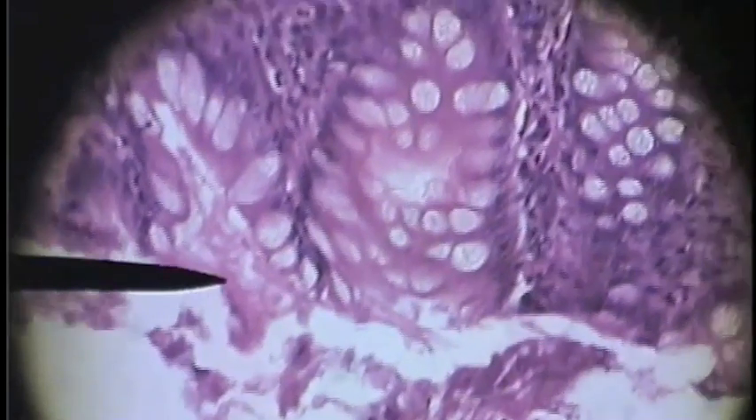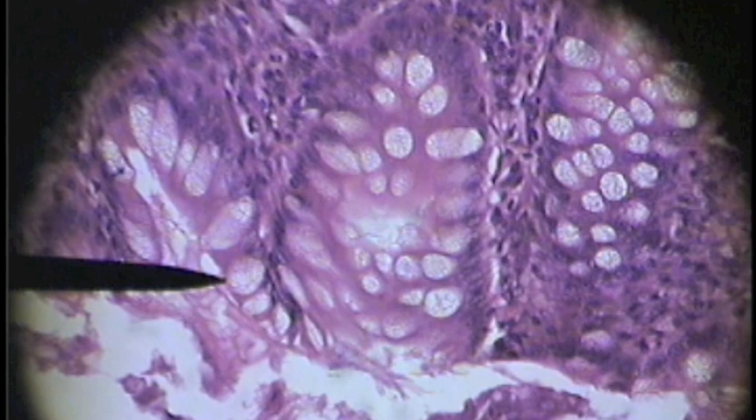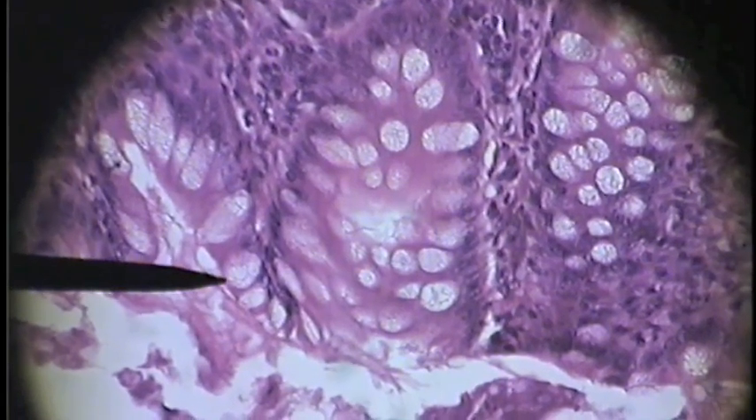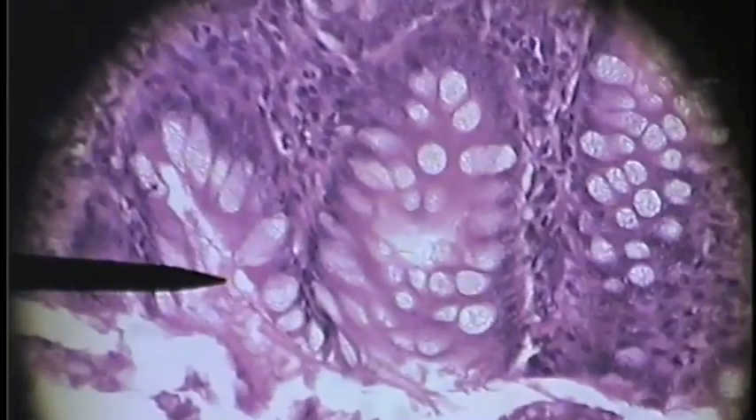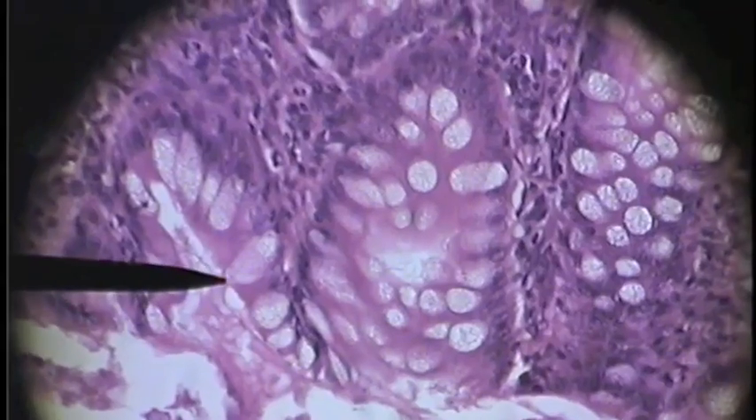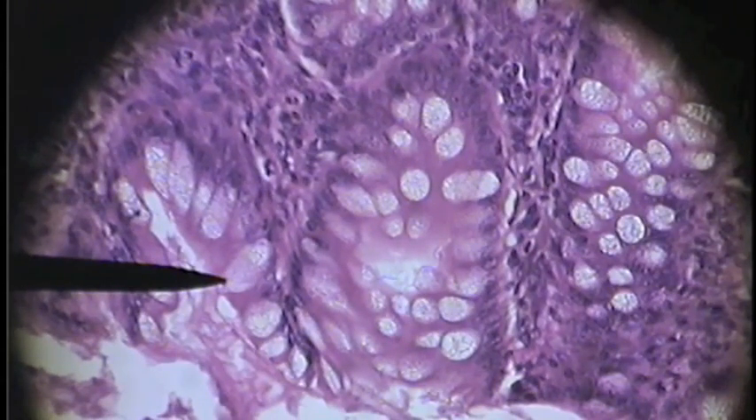We are now looking at the large intestine and the pointer is on a goblet cell. You can see the nice open goblet cell filled with mucus. There are lots of goblet cells in the large intestine.